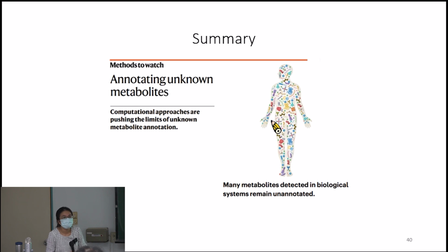May I ask about the input data for the neural network system? Which system? The input data, so they are using like the mass spectrometry database? Yes. All of the work that we are talking about basically uses the mass spectrum data. But the difference is we have different algorithms to generate different library references. They can help us match with our unknown samples. But all of this is based on the mass spectrum data.